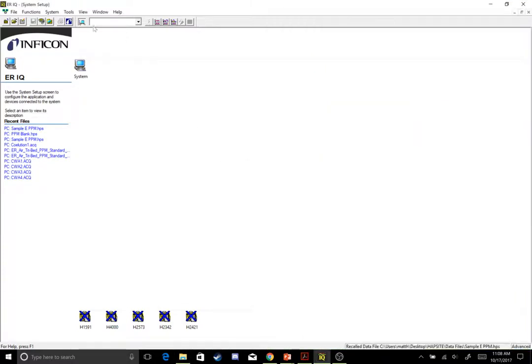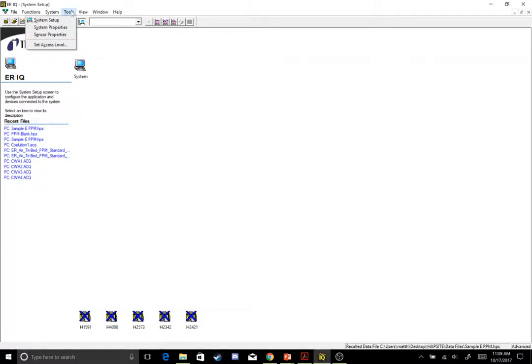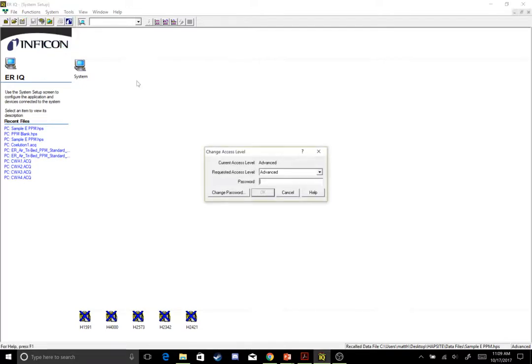Once that's there, let's open up our ERIQ software and we're going to have to set our access level so that we can change some of these settings. That'll be under Tools up here at the top bar, Set Access Level, and make sure that's set to Advanced.